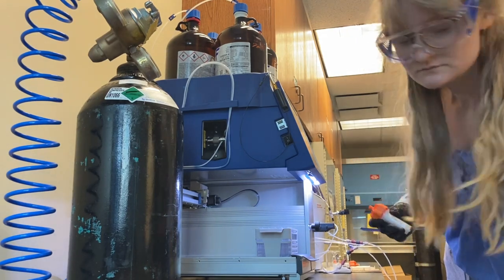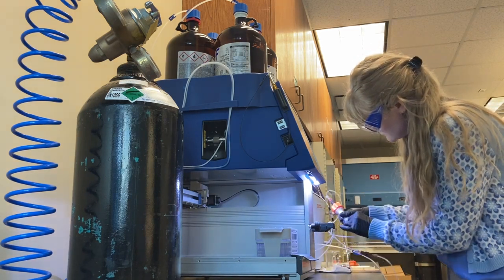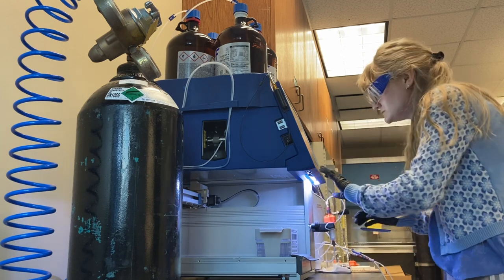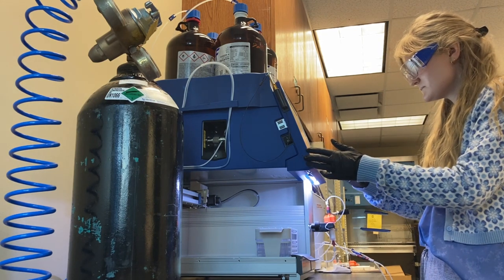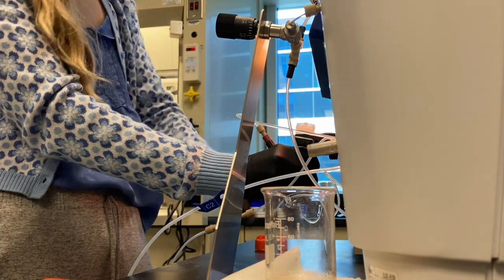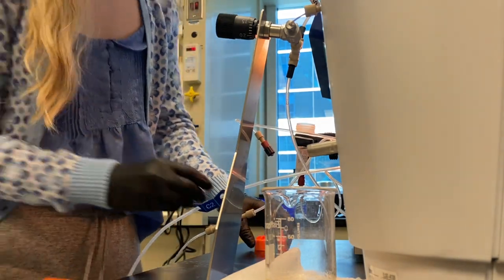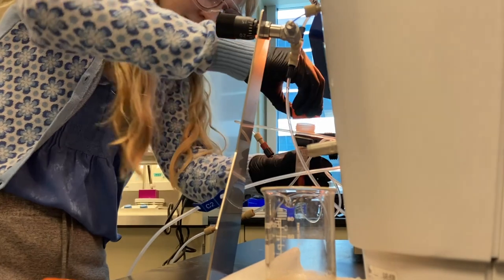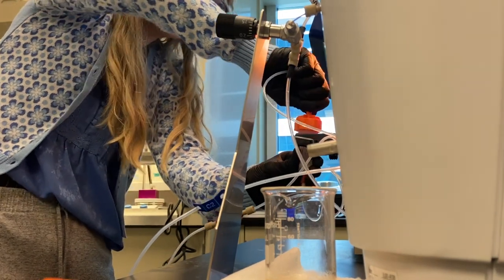Here is a side view of our Biotage — it's not that pretty. We have it hooked up to an ELSD detector, which is why we have the nitrogen tank. The ELSD is able to read compounds that are not UV active, like cyclohexylamine, which has no double bonds and can't be seen by a UV detector alone. This detector is able to nebulize it so we can actually see it show up on the screen, which makes life a lot easier when working with non-UV compounds. The total price of our new Biotage and the ELSD was a little over $50,000 — still a pretty penny, but definitely worth it if you're doing a lot of column chromatography.